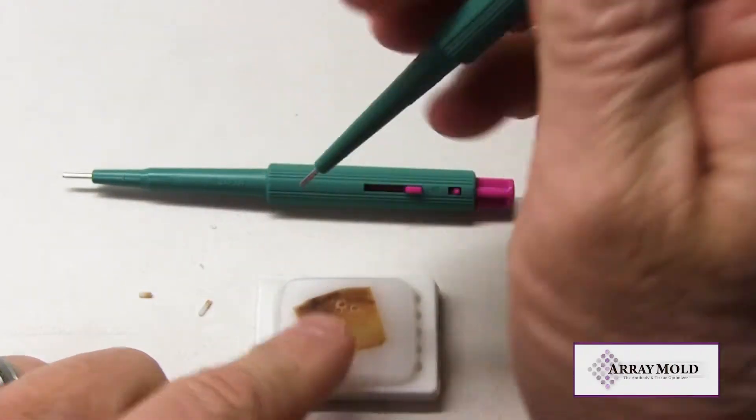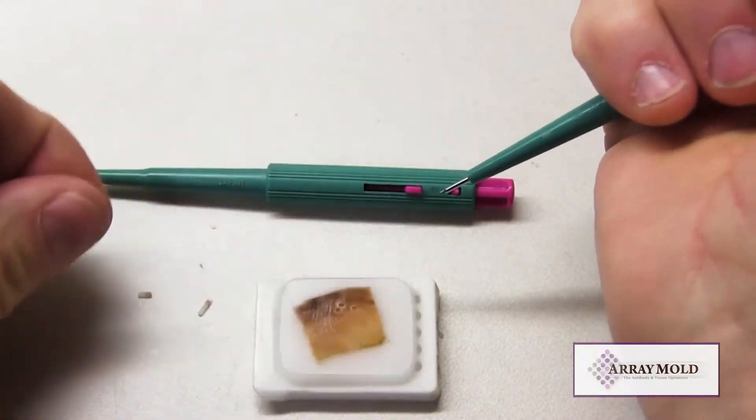As we continue to punch, the needle with the stylet will be consistent because of the stainless steel stylet.